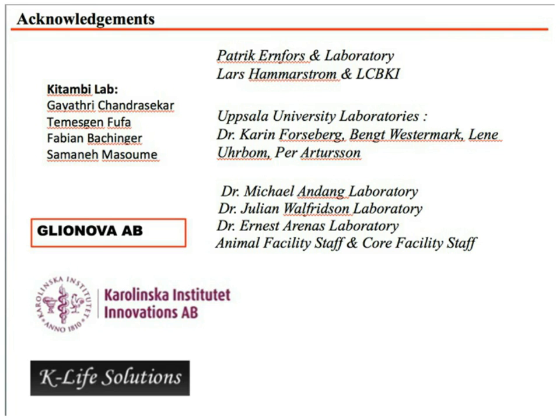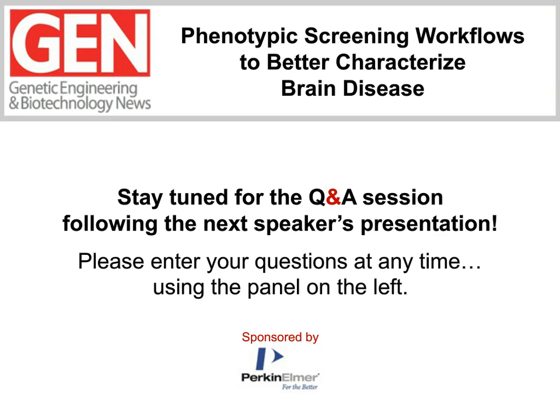Thanks, Satish. That was a great presentation to get us started, and you provided us with some great insight into how high-content analysis can be utilized as a small molecule screening tool for the drug discovery process.